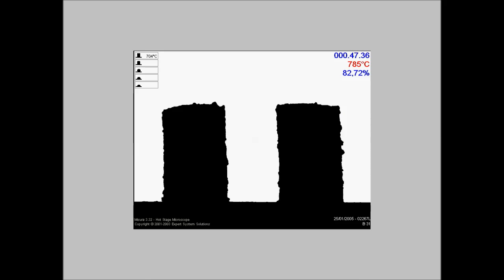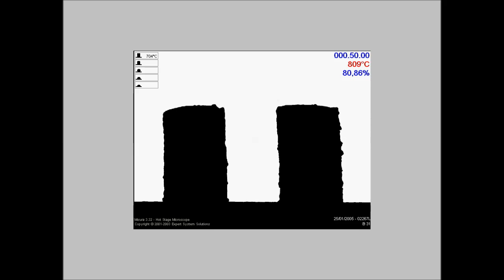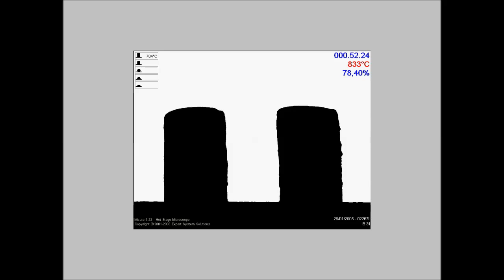All the image analysis functions are the same as in the other models. The zoom function allows analyzing one or two samples at a time. This movie shows the recording of a test on two samples of ceramic frit.